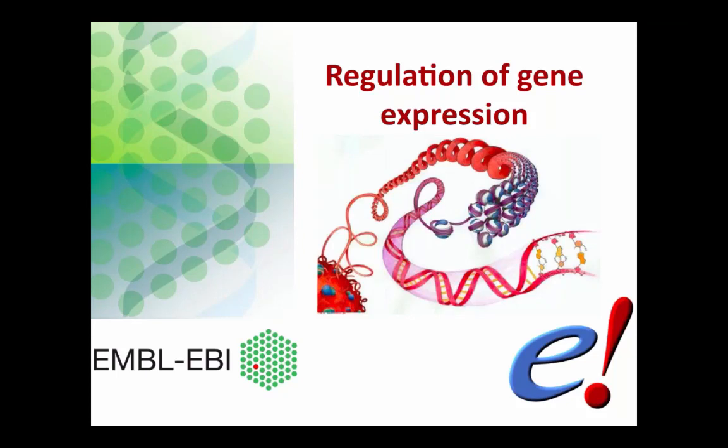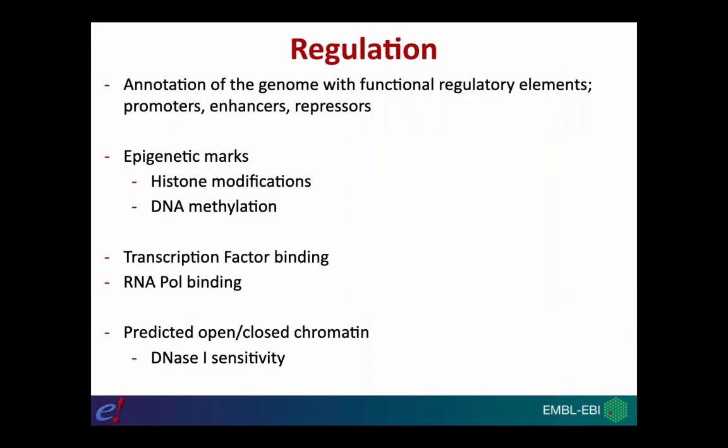What we want to do today is explore the annotation of regulatory features and how to find information about those features in the Ensembl genome browser. Within Ensembl, we annotate the genome with functional regulatory elements, which typically consist of features such as promoters, enhancers, and repressors.